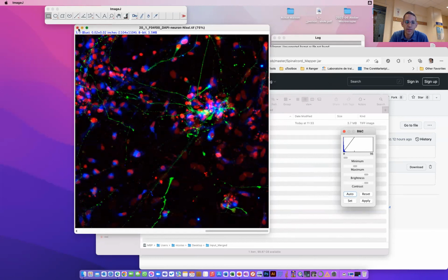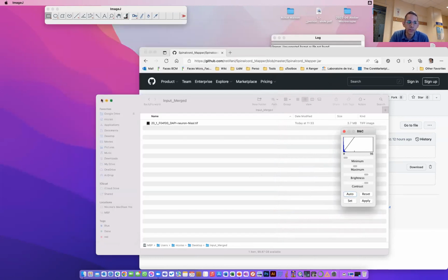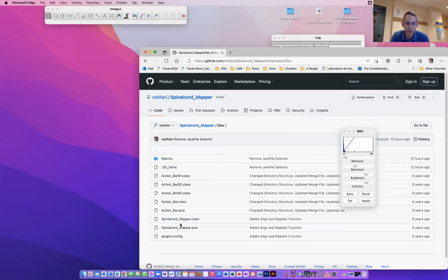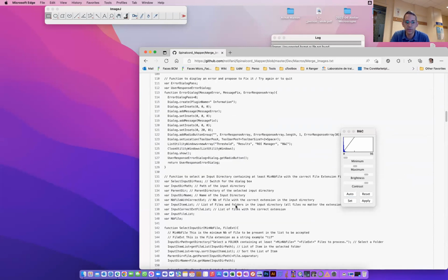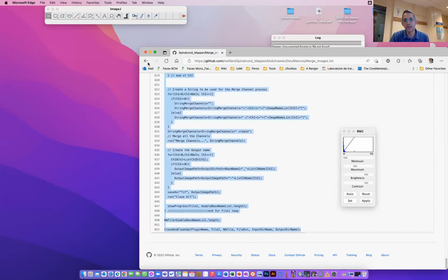So that was a specific example. Just to let you know, if you want to learn about coding, you can steal what people have done before. And in this case, if you want to know what's the code that will allow me to do the merging, for example, the code is quite long because I made it to be useful for many, many people. But you can actually just click on that, and then you have the full code here. It's a very simple function, but if you want to make it work with all possible cases, then it has to be a bit long.